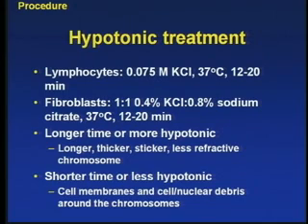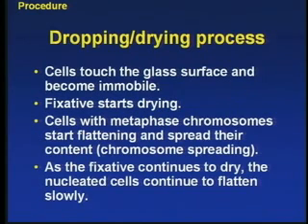On the other hand, if you do it too long, you might see a good preparation. You say, let's shorten the time or the hypotonicity of the solution. What happens is that you get a lot of cell debris around the chromosomes. Again, that's a problem, because if there is any particular chromosome exchange, it's masked by the huge amounts of proteins and other things, and you're not able to see it. So you just have to play around with these things.